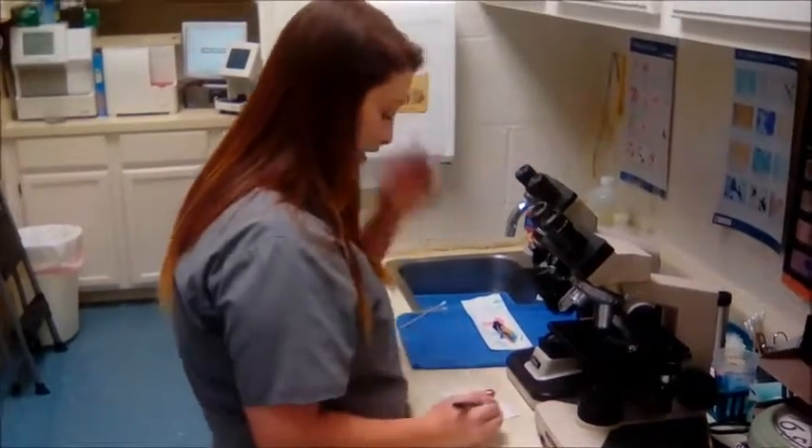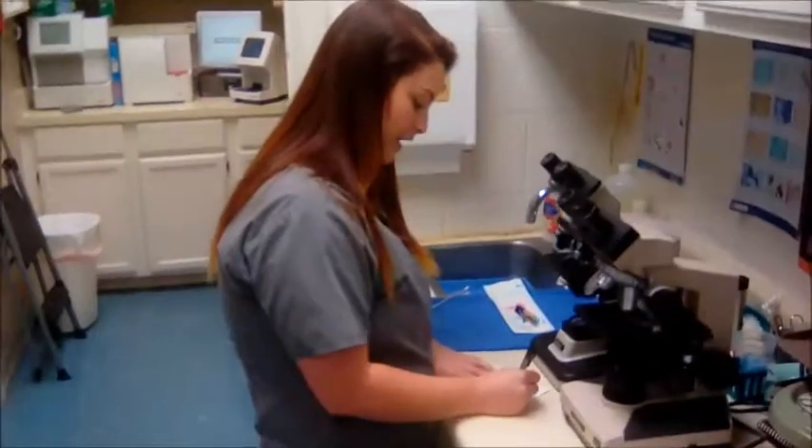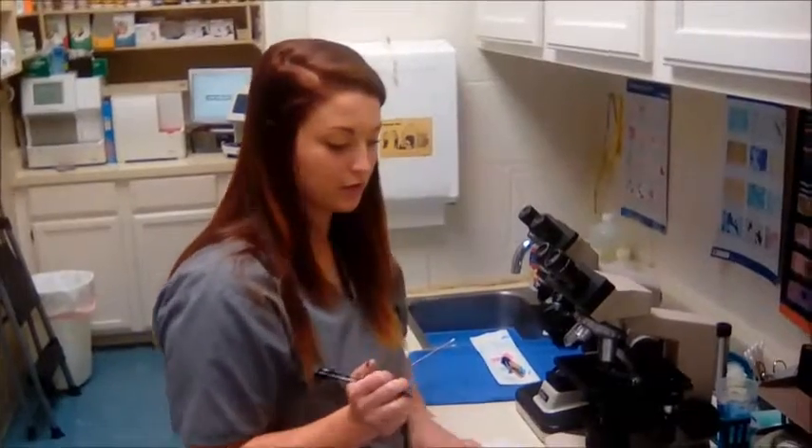Okay, so I've gotten 55 and I'm going to take that number and I'm going to divide it by 10, which will give me 5.5, and I'm going to drop that down into the chart and say it was positive for yeast.